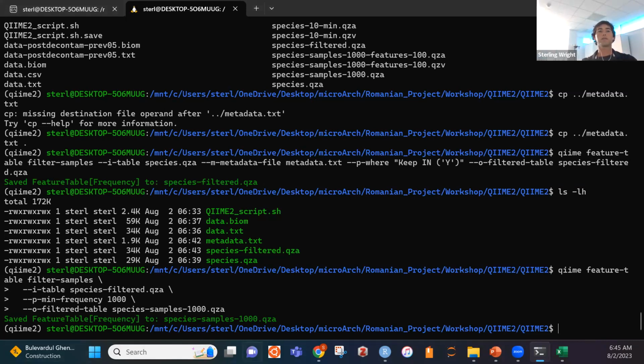And then I don't have it here, so I'll type it out. We also have in microbiome data some low abundant taxa, taxa where we only have, let's say, 5 or 6 counts in one sample. More than likely, those are what we call spurious mappings.